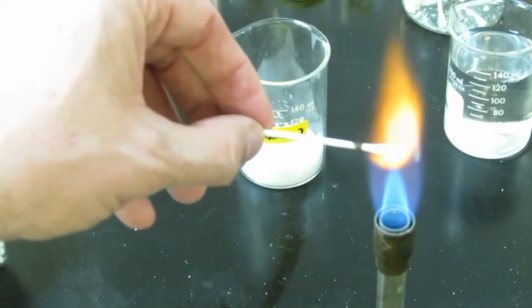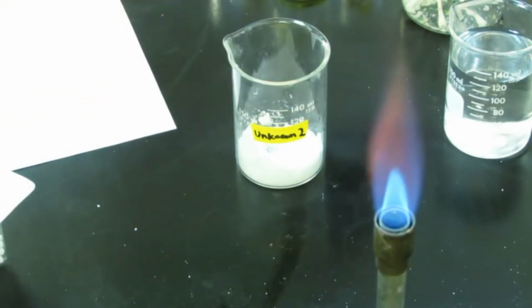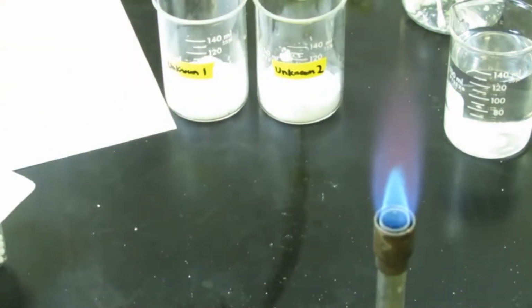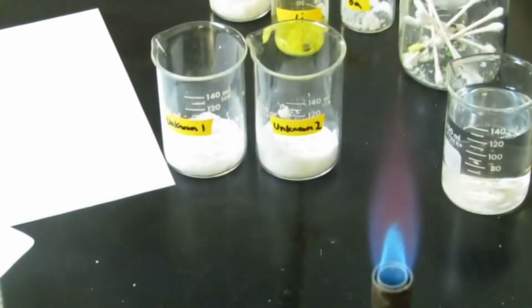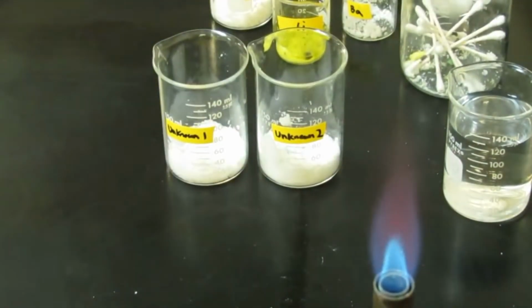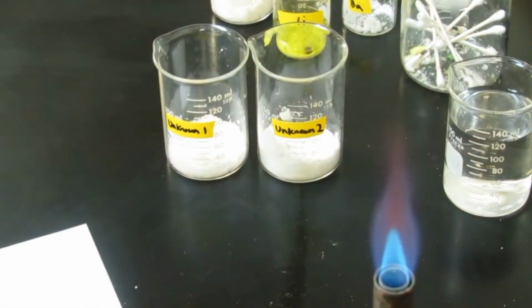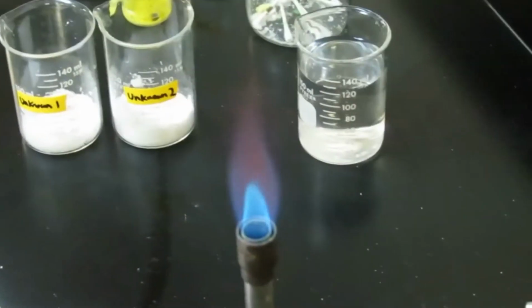Alright, so now it's up to you to determine what those two unknowns are, unknown 1 and 2, based on their flame test color. Remember, you have to complete your lab report, so take some time doing that, and that'll be due next time we see each other. Remember to shut down your burner and clean up your area.